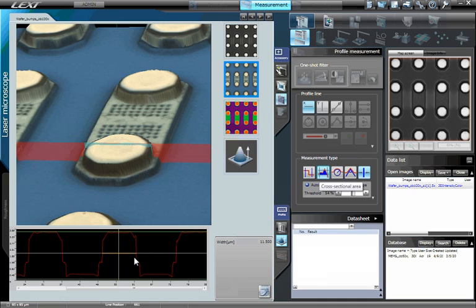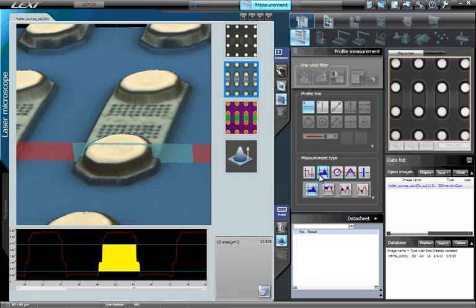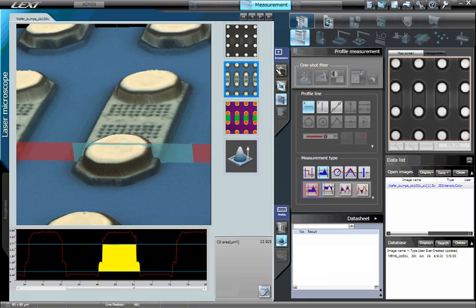The cross-sectional area of these wafer bumps can also be measured by clicking on the button Cross-sectional Area as the measurement type. Choose to measure the area of a peak or valley with a single straight threshold line or with two horizontal and vertical lines. In this example, we will choose to measure the peak between two horizontal and vertical lines.